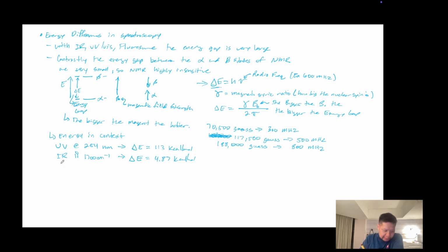Let's compare that though to NMR, and proton NMR at that, which is the most powerful of the NMRs. Not powerful like the most powerful is in method, but it's the one that has the highest energy gap, right?